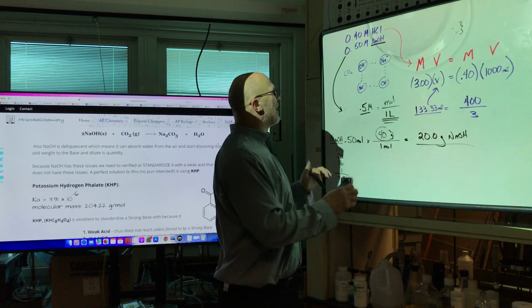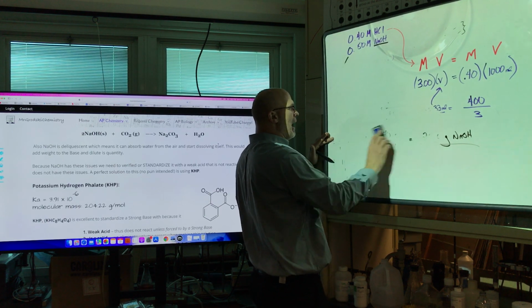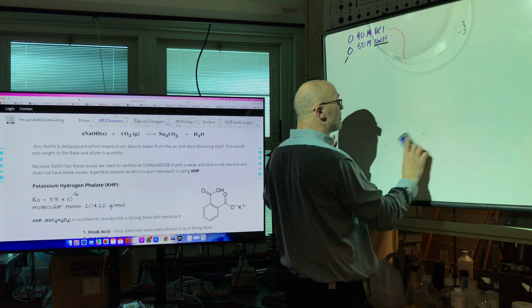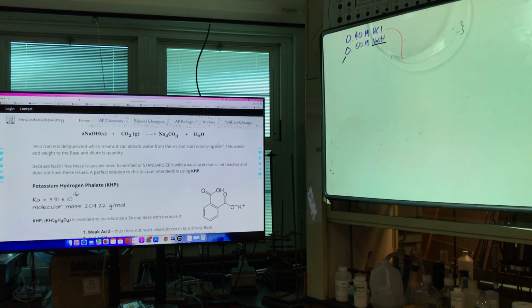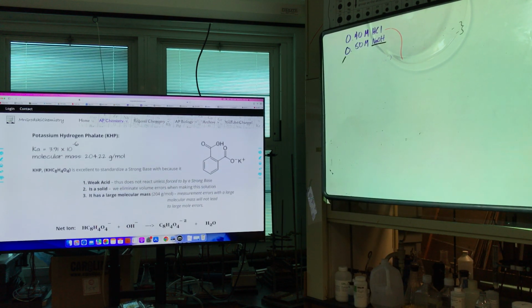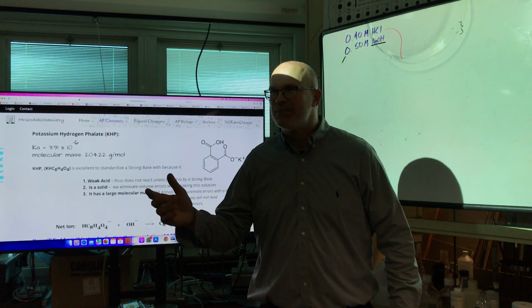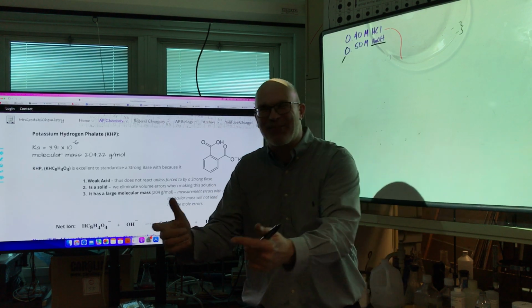Okay. Now, what is standardization? We've got to verify. It's okay. Guys, I want you to calm down. It's okay that we don't know exactly what the sodium hydroxide concentration is, because we're going to figure it out exactly. And we're going to use something called KHP. Say it with me. KHP. You've got to say it with me.